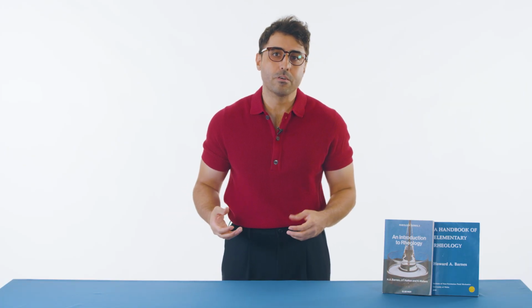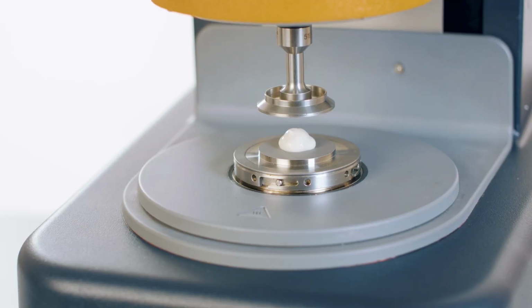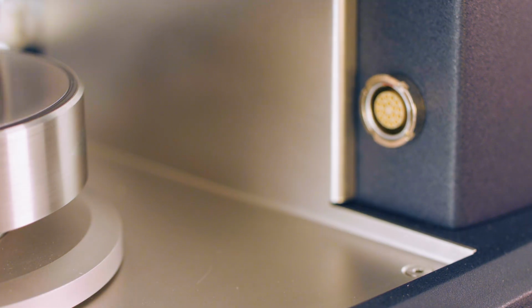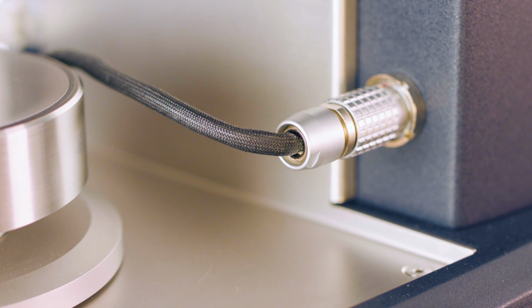Now, you might be wondering, how do we apply that torque to the material? That's where the geometry comes in. Just as an engine requires the correct fuel to operate efficiently, a rheometer relies on the appropriate geometry to ensure accurate and reproducible measurements. The geometry is the shape of the tool that holds and deforms the sample, and it directly affects how we interpret the raw signals.